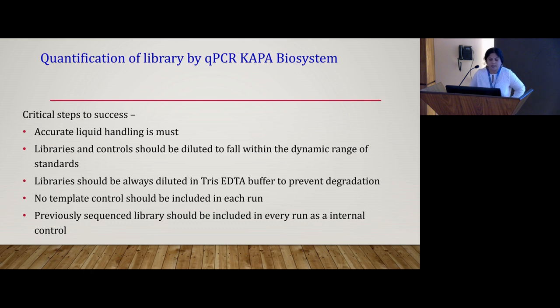Critical steps for success: accurate liquid handling is a must. Libraries and controls should be diluted to fall within the dynamic range of your standard. Libraries should always be diluted in a Tris-EDTA buffer to prevent degradation. Note: an NTC should be included in each run, and a previously sequenced library should be included in every run as an internal control.